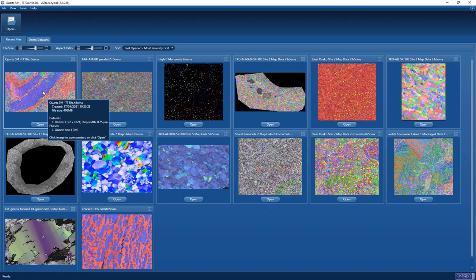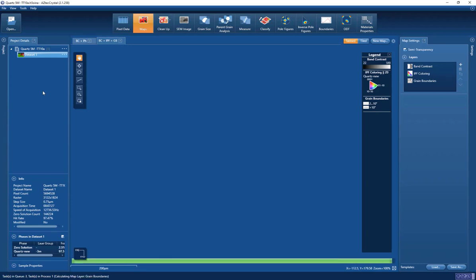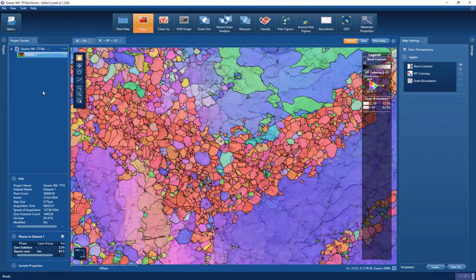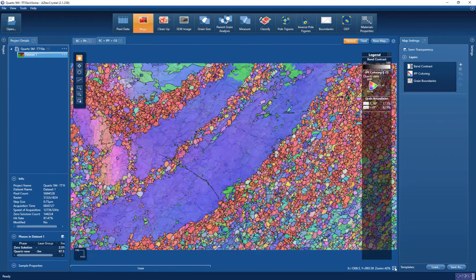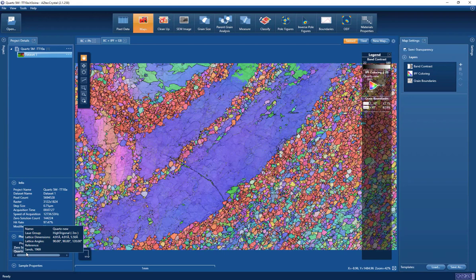This is a quartz rock — about five million EBSD analysis points — and it's a partially recrystallized shear zone. When we open up data for the first time in Aztec Crystal, it will calculate an orientation map and also a phase map so we can immediately evaluate the microstructure. On the left-hand side we see basic information: the hit rate is about 97.5%, the step size 750 nanometers, and the phase information showing high trigonal quartz used for indexing.